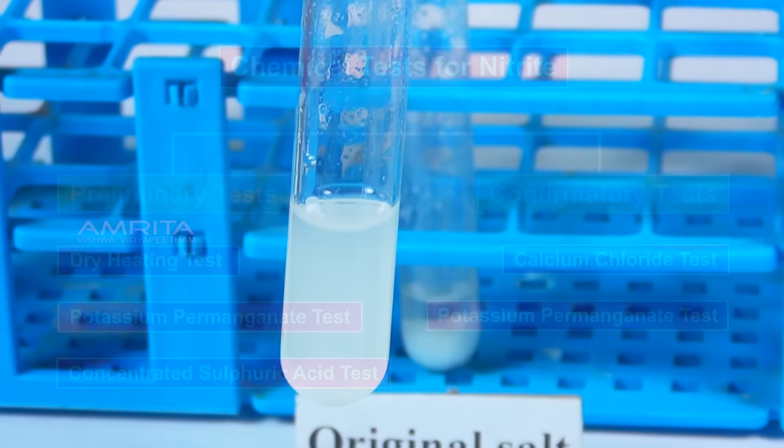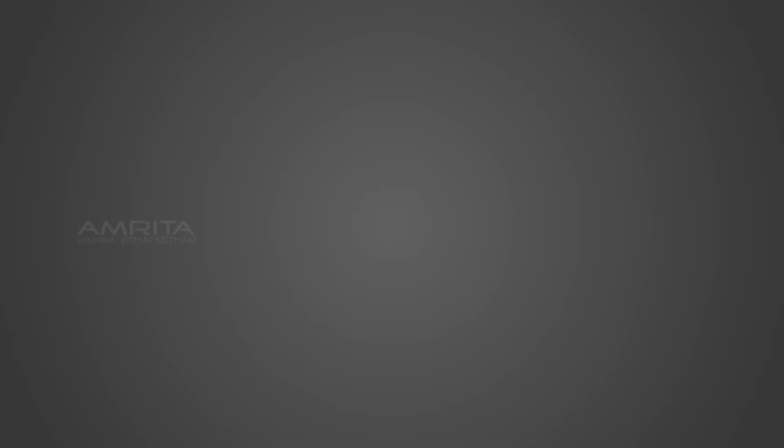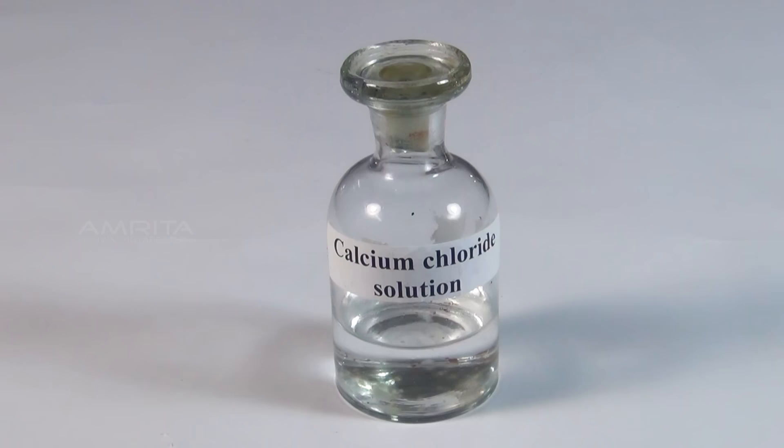Next, we look at the confirmatory tests for oxalate. They are: calcium chloride test and potassium permanganate test. Calcium chloride test. Materials required: aqueous solution of the salt, dilute acetic acid, calcium chloride solution, dilute nitric acid, test tube, test tube holder, droppers, and Bunsen burner.